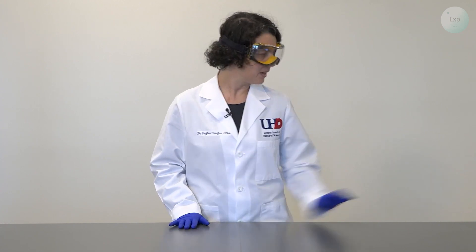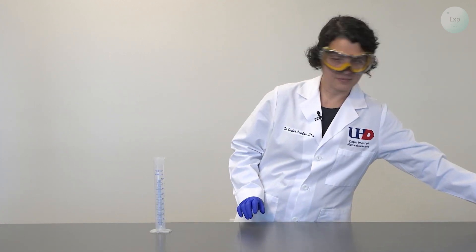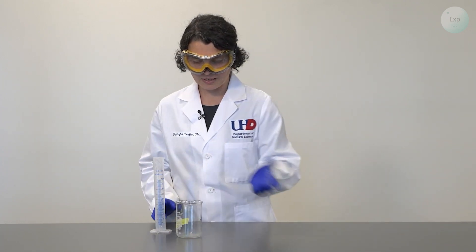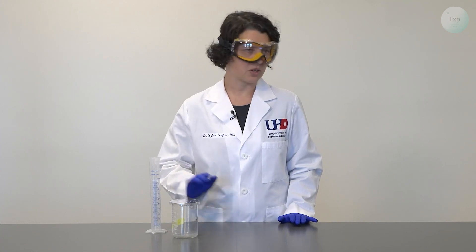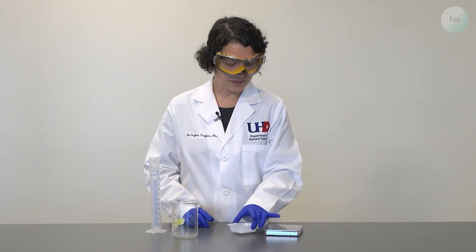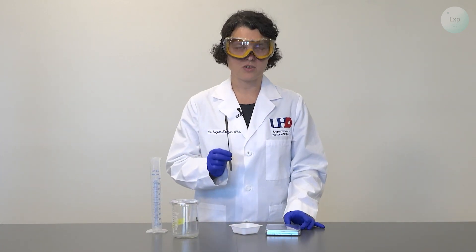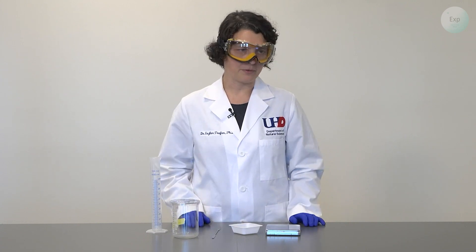For this experiment, we're going to need quite a bit of equipment. To start, we're going to need a graduated cylinder, a beaker, and we would like to close this beaker with some kind of lid. I am using a petri dish for that purpose today. I am also going to need a scale with a weighing boat, and should I need some assistance with scraping or extracting material, I will need a spatula for that.